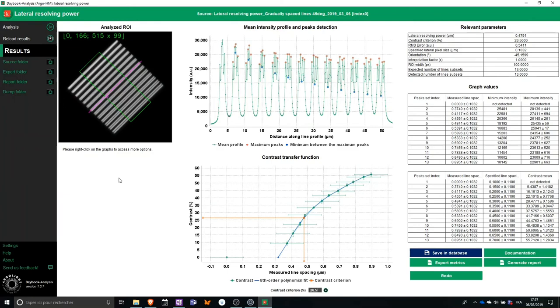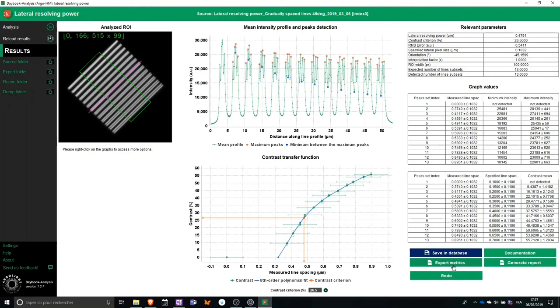So now I've got my results. And maybe I want to share that with After Sales. To do so, what I can do is generate a PDF report, and by clicking directly here, export the raw data as a CSV file or save that information in the Daybook database.